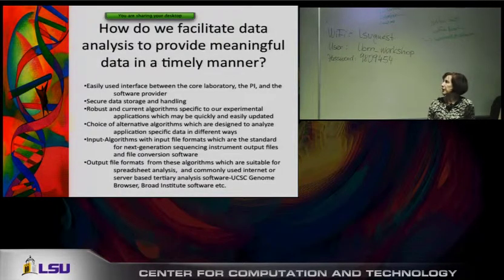As input, we need algorithms with input file formats, which are the standard for our next generation sequencing instrument, output files, and also file conversion software. And we need output file formats from these algorithms which are suitable for spreadsheet analysis and commonly used internet or server-based tertiary analysis software, such as the UCSC Genome Browser or the Broad Institute software.